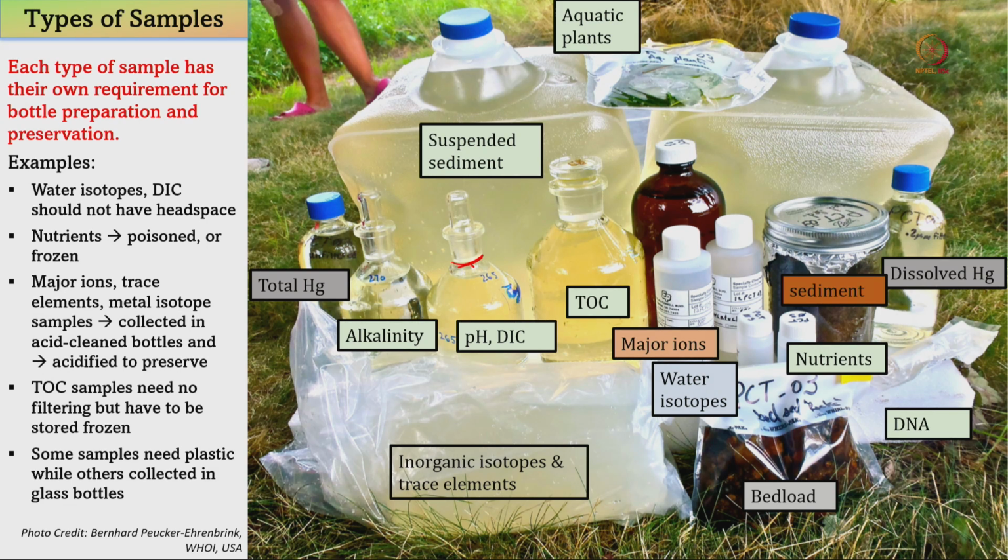When the sample is collected from that location to when we bring it to the lab, during the shipping process, whatever losses will happen, we have to take care that there are minimal losses and that the sample is intact. Therefore, we use different types of water bottles.